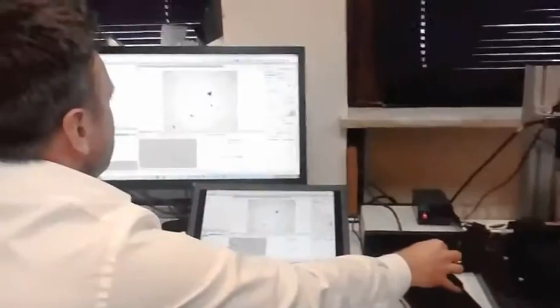So Karen, can you tell us a little bit about the software here? We have, I can see a live view here. I can probably get this into focus a little bit here. Start to bring those in.